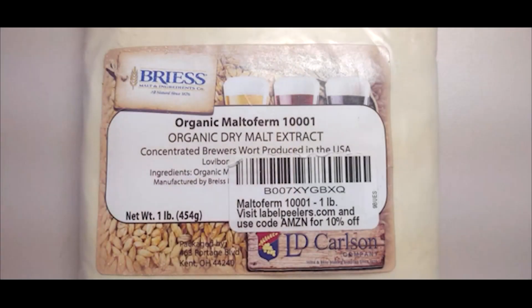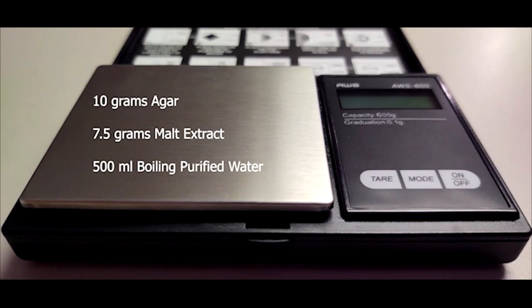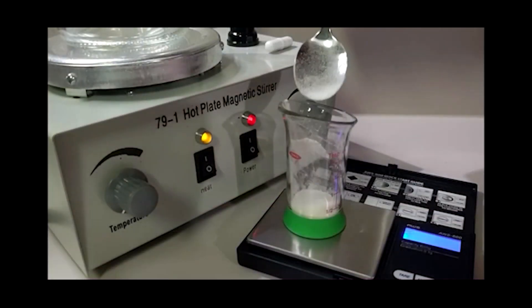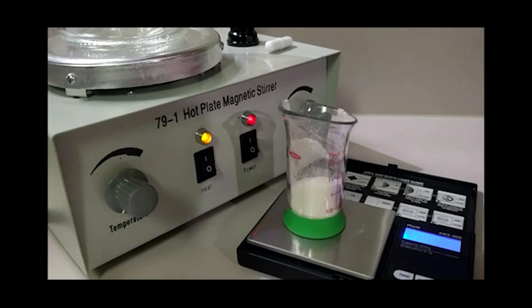We have since come up with a standard MEA recipe that promotes the onset of rhizomorphic growth while reducing contamination: 10 grams agar, 7.5 grams malt extract to 500 milliliters of purified water. Through research, we found that adjusting nutrient levels changed the growth to a more rhizomorphic pattern. When we dialed back the malt extract, the mycelium stretched out searching for nutrients while containing or eliminating contamination.